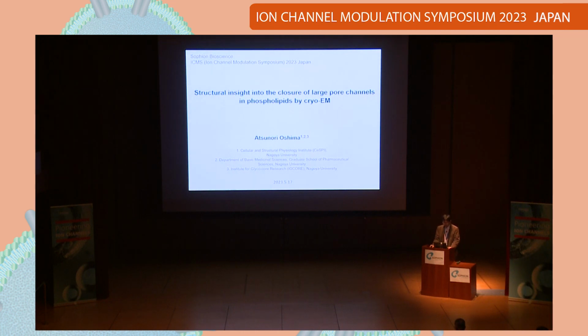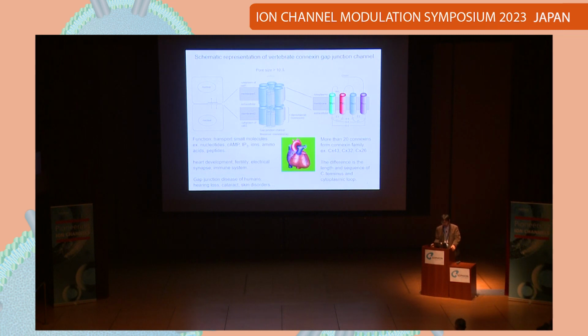So here I'm going to talk about the structural insight into the closure of a large pore channel in phospholipids by cryo-EM. First, I'd like to give a brief introduction about gap junction channels.